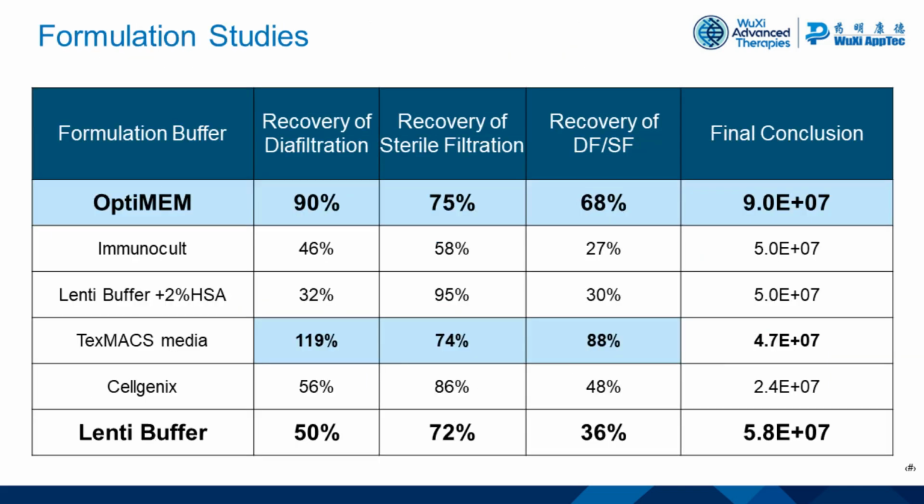Lentivirus, being an enveloped virus, is susceptible to freeze-thaw stress. We evaluated various media which can give better cryoprotection against freeze-thaw stress. Our preliminary data shows significant increase in recovery and titer in OptiMEM media and TexMAX media when compared to our standard Lenti Tris buffer system.